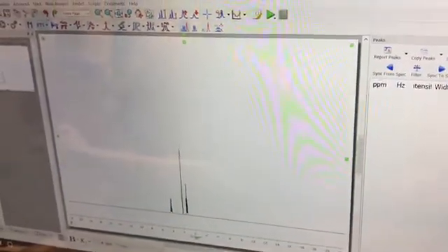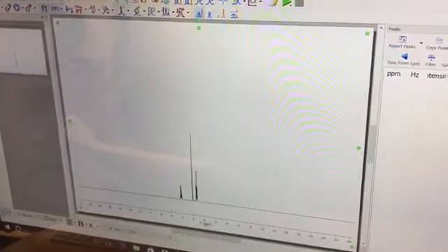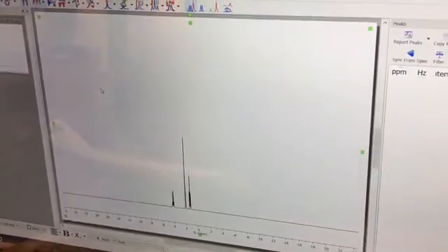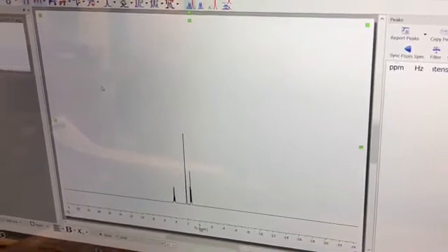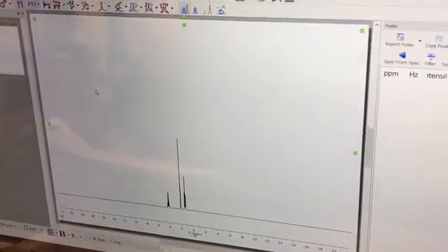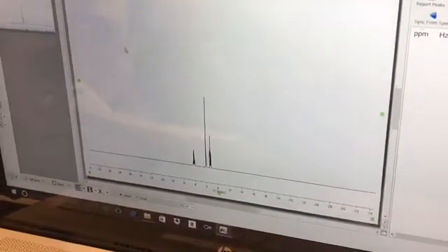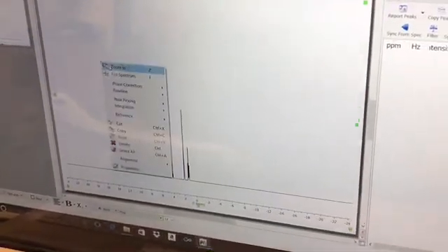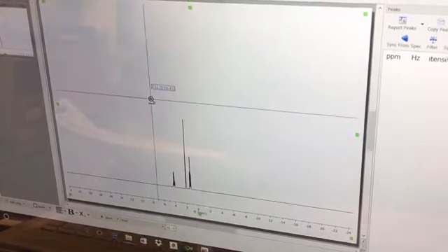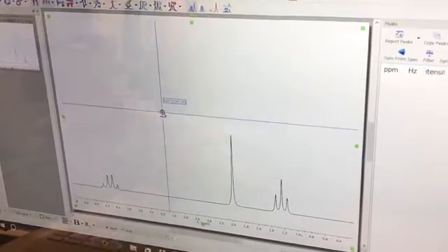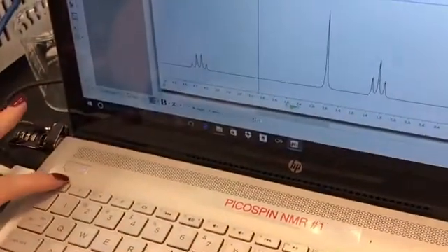Now that you've opened the MESS Renova window, you'll be using this program to analyze your data. So, one of the things you can do in this program is you can right-click and select different modes. You can then leave those modes by pressing ESC on the keyboard. So for example, you can right-click, select Zoom In, and use this to zoom in on your peaks, and then to exit this mode, you would just push ESC on the keyboard.